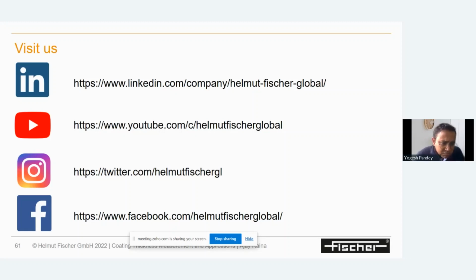Next question is again from Mr. Sujit. Aluminium and silicon percentage in PVD hard coating can be checked with an SDD detector. Yeah, if we are using an instrument with a vacuum mode or helium purge option, then it is 100% possible. When we are using normal instruments, then thickness can be measured, but the percentage of aluminum and other properties cannot be done.